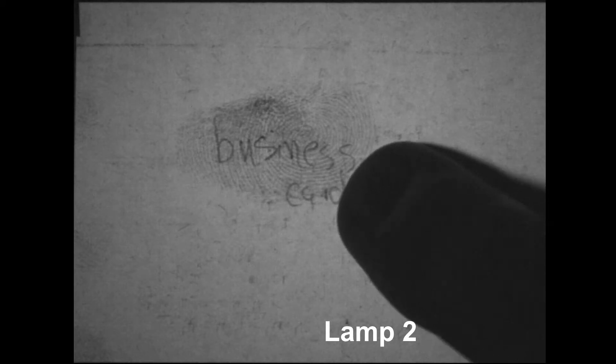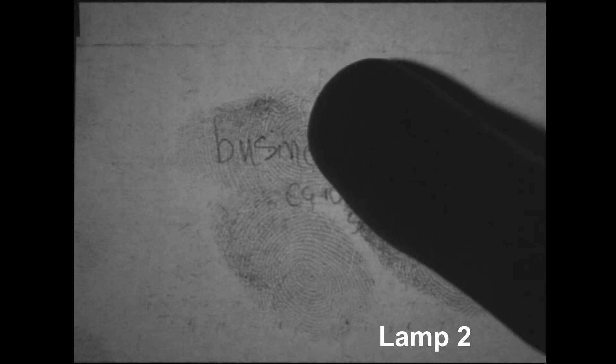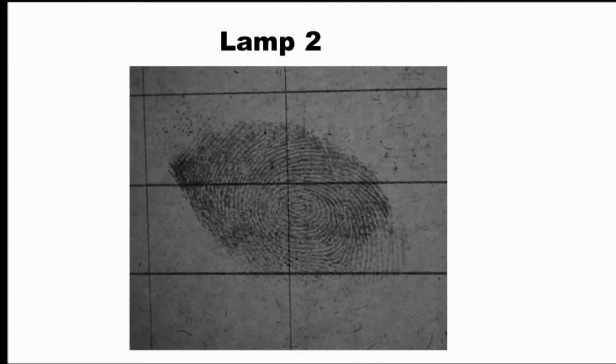Another fingerprint is applied and it's clearly visible using lamp two. When lamp one is turned on, the fingerprints are not visible. Another fingerprint is applied which cannot be seen under lamp one, but when lamp two is turned on, the new fingerprint is clearly visible. Latent fingerprints are not visible when illuminated using lamp one, but are clearly visible when using lamp two.